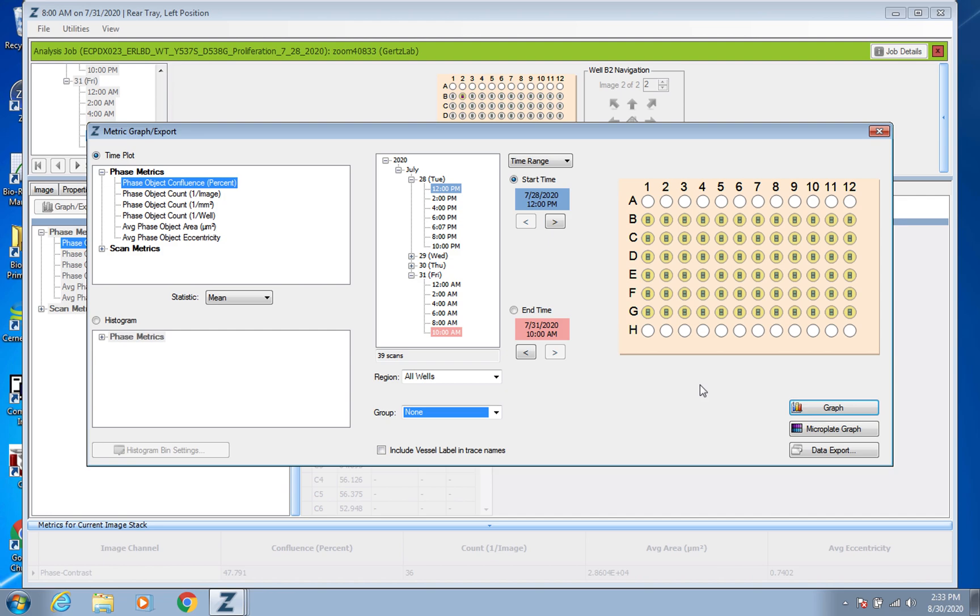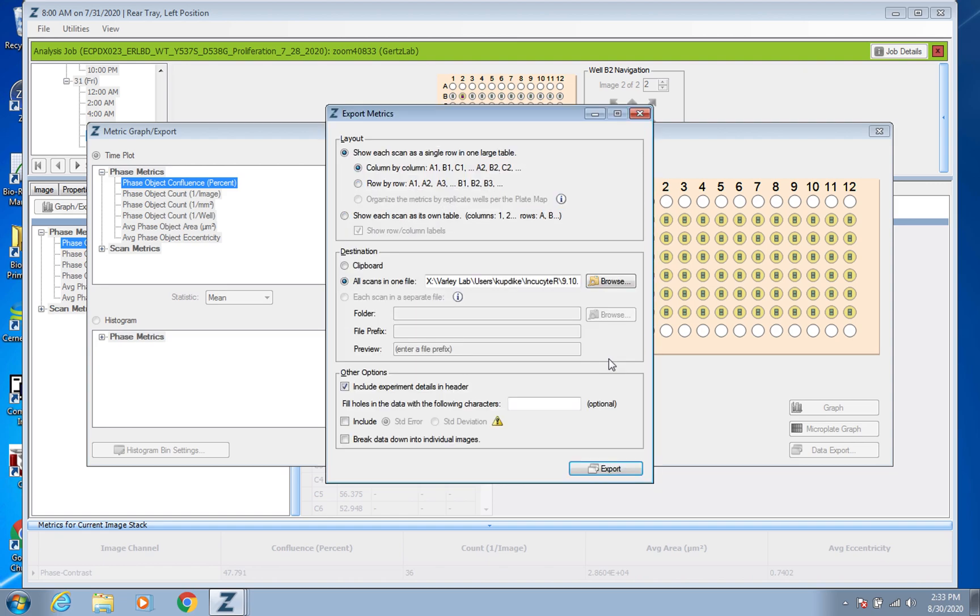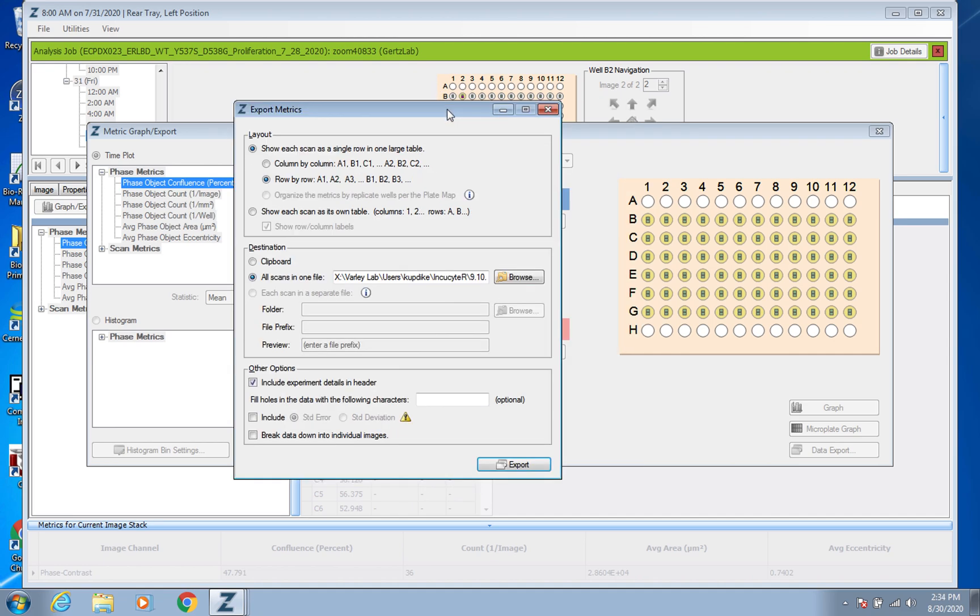And at this point you could go to Data Export and so it should come up like this and you can kind of think about it how you want depending on how your plate's set up. I think it might be easiest to have it come out giving you the data row by row.